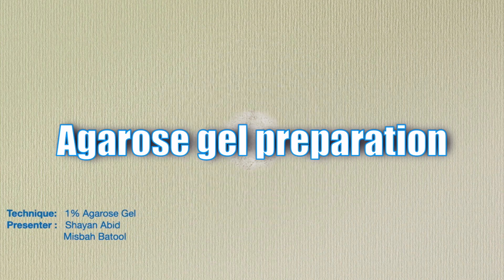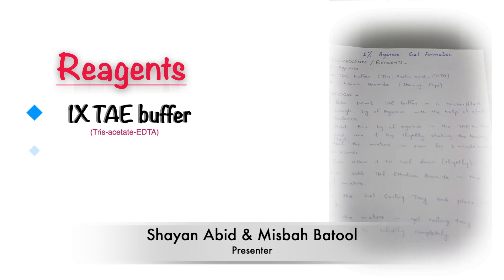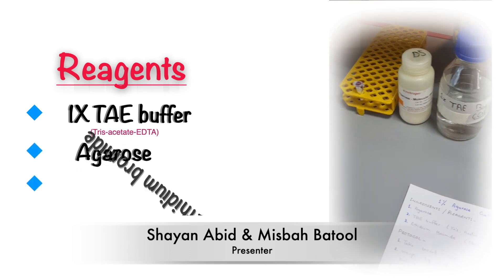In today's video, I am going to show you the complete protocol to make 1% agarose gel. We will be using 1x TAE buffer, agarose, and ethidium bromide.